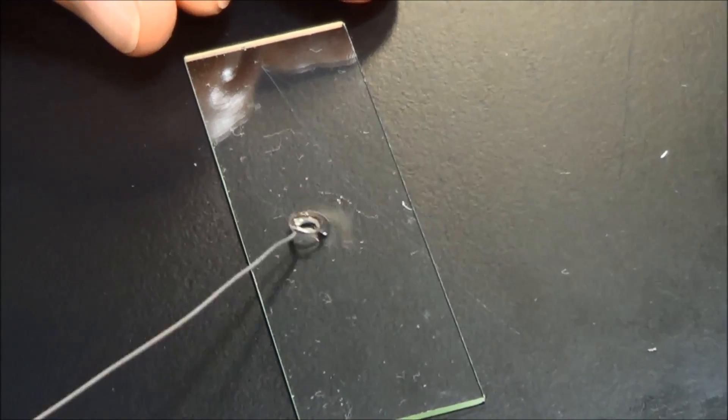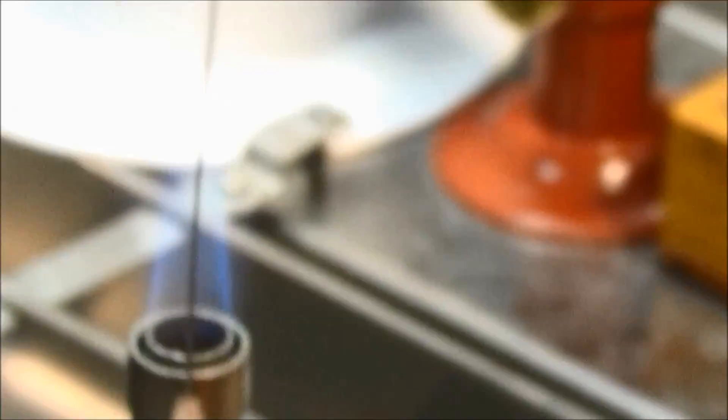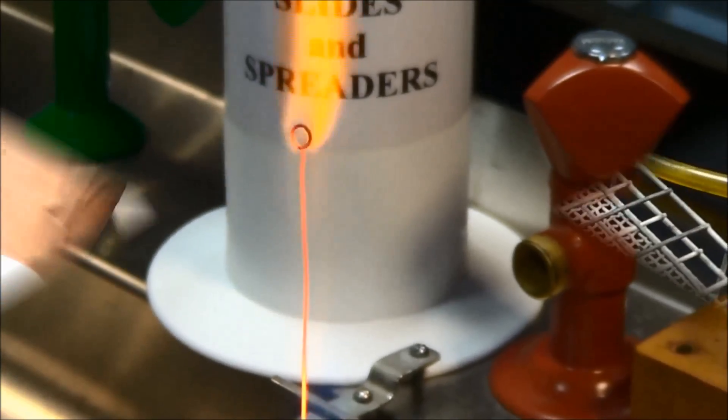A cell suspension that is too dense will make it difficult to examine the cells. Re-sterilize the loop.